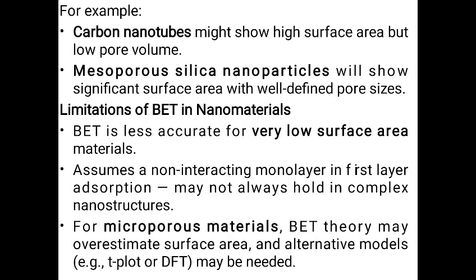For example, carbon nanotubes might show high surface area but a low pore volume, and mesoporous silica nanoparticles will have significant surface area with well defined pore sizes.